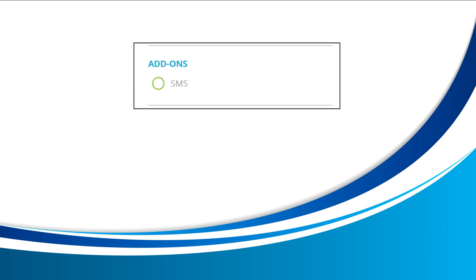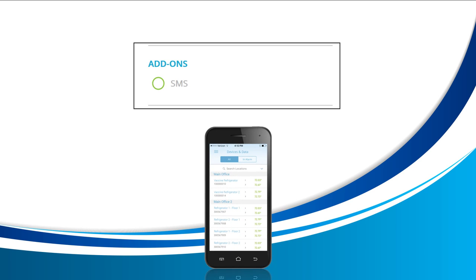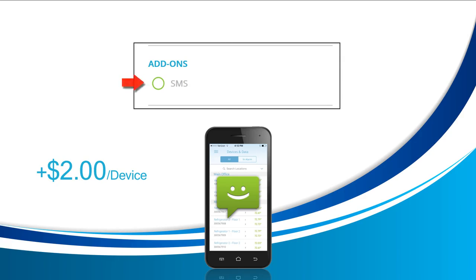Next is add-ons. Add-ons are optional, extra features you can add to your account to enhance your TraceableLIVE service. Choosing the SMS add-on will allow you to receive text message notifications straight to your phone for your TraceableLIVE devices. Enabling SMS is only $2 more for each TraceableLIVE device. If you prefer not to have SMS enabled, be sure to have this button unfilled before you continue.